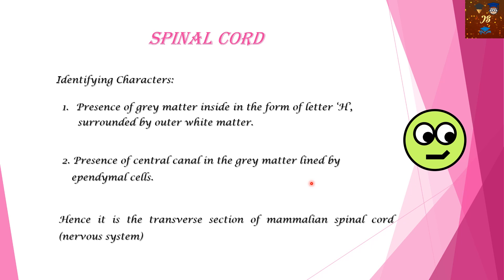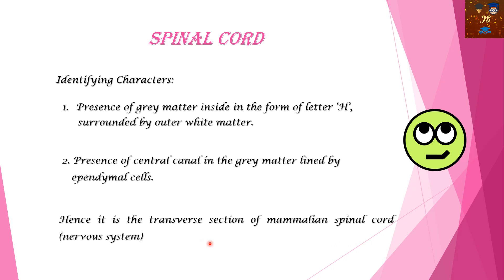So it is the transverse section of mammalian spinal cord. If you have to write in your practical laboratory notebook, you can write the identifying characters one and two, and then write that hence it is the transverse section of mammalian spinal cord. You should specify 'transverse section' because not writing it may imply it could be a vertical section as well.